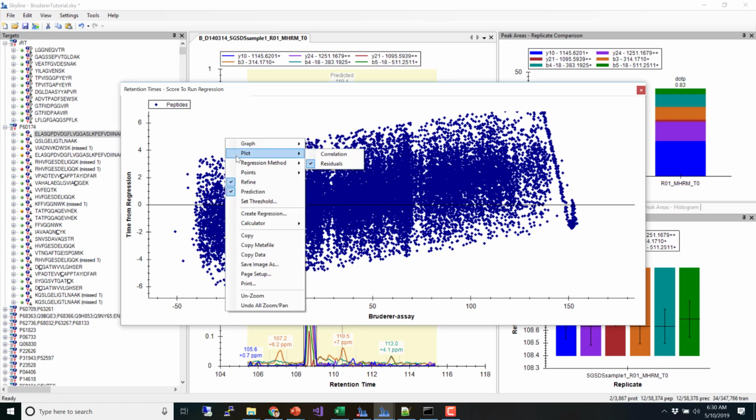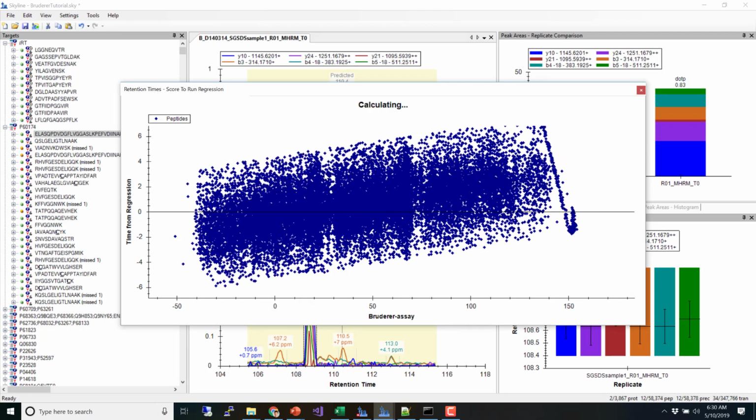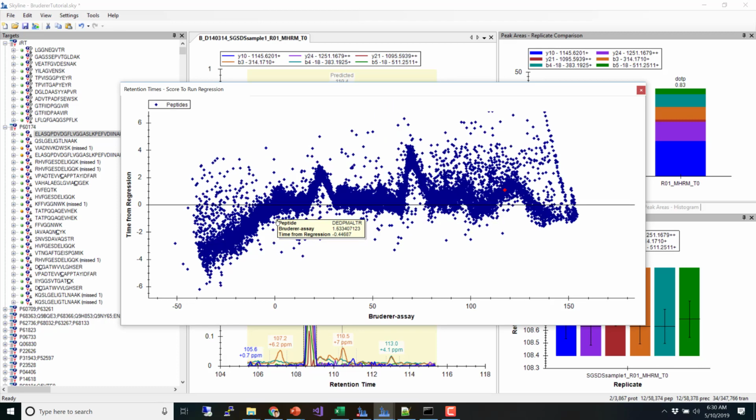That is going to be polluted by the fact that there's so much curvature and bouncing around here. So we have much tighter clustering, but all we use in the score is the distance they are from their starting point, right?